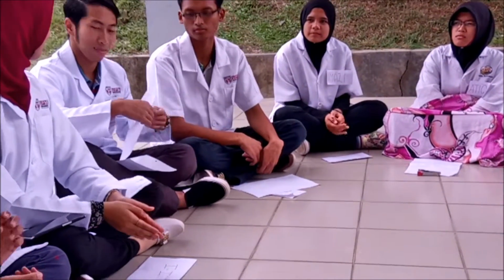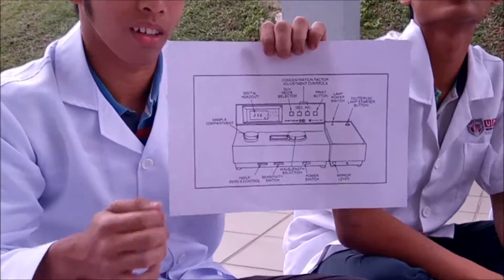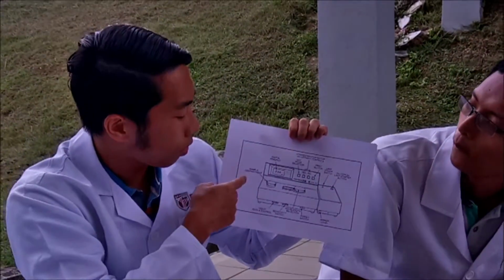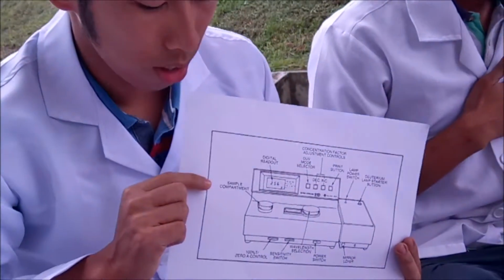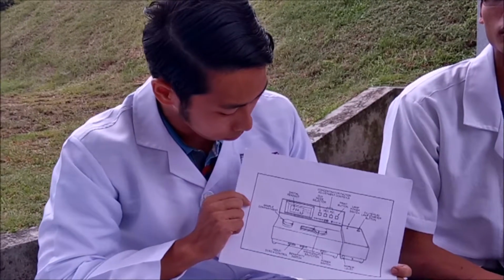Now, could you explain more about the structure of the spectrophotometer? Alright, so basically this is the spectrophotometer here. Can you see it? Yes. And every part of it has its function. The first is the sample compartment. The sample compartment is used to hold the sample solution, and we must be very careful when handling it because even a slight fingerprint can interfere with the result.